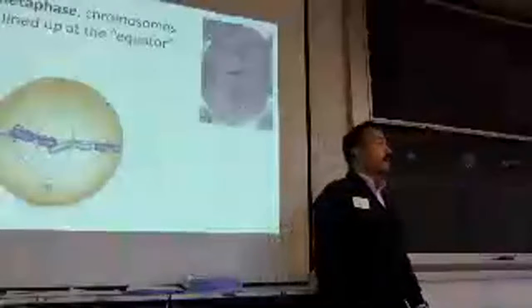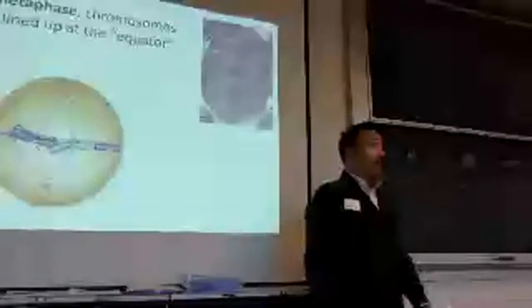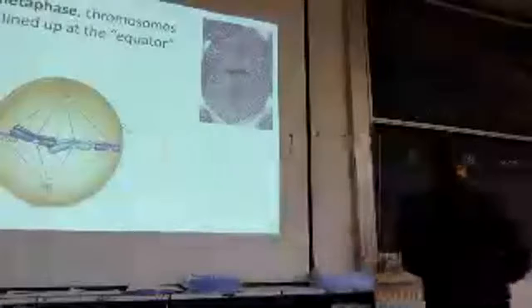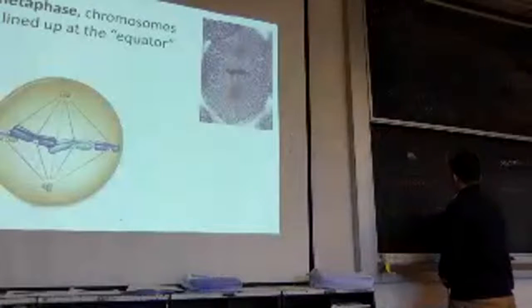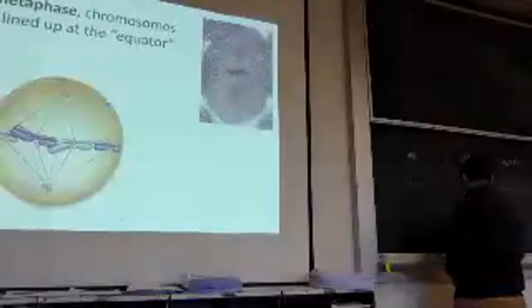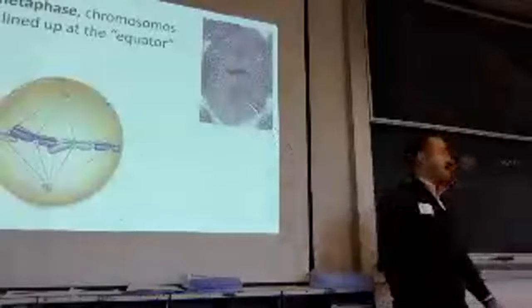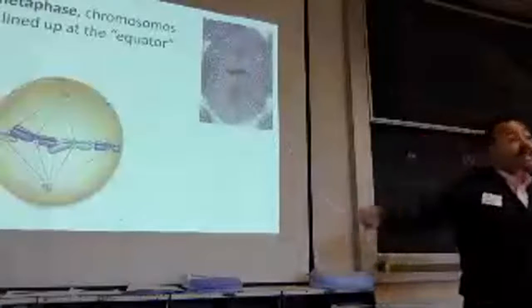These are called centrioles or centrosomes. I'm not going to test you on those. I want you to be able to identify a cell in metaphase. Okay, we've lined it up.